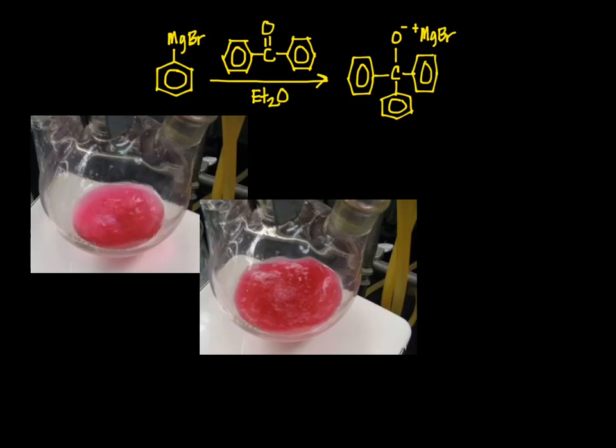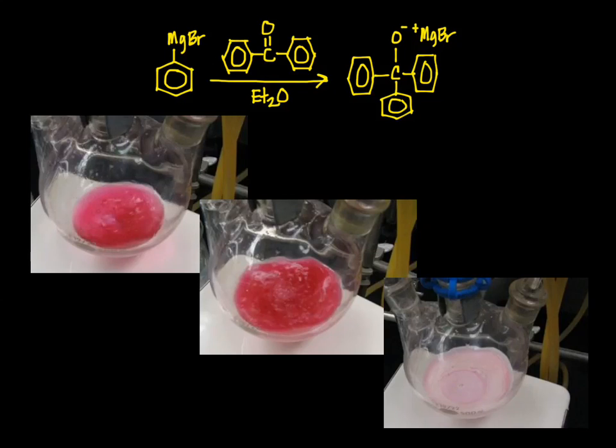Partway through the addition, you should see a white precipitate begin to form. If you look closely at this picture, there are faint swirls of white in the pink solution. At this point, the ether is saturated with the triphenyl methoxy anion, and it's beginning to precipitate out as the white magnesium bromide salt. As you continue, more and more of the salt precipitates until it appears to be one solid mass. It's not. It's just a lot of solid and a relatively small amount of ether.